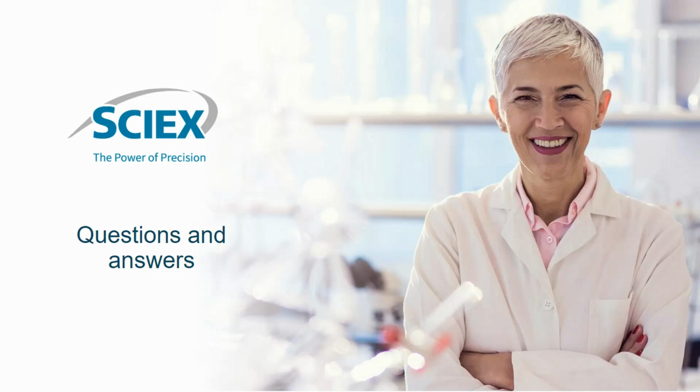Awesome. Well, that's a good question. One of the key things that we know and hear about working in GxP and GLP environments is that at some point, you want to become more regulated in regards to data compliance. What this means is that a lot of labs want to make sure that their analytical instruments and their analytical software obey 21 CFR Part 11 compliance tools.